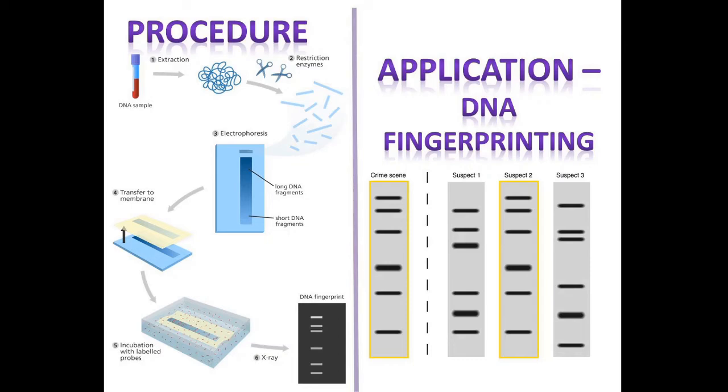To detect a restriction fragment length polymorphism, there are a number of basic steps to which multiple technologies and protocols have been applied. The DNA must first be isolated from the organism or cell of interest, whether that be a prokaryote such as a bacterium or a virus, or a eukaryote such as human cells, with protocols varying depending on the source of the DNA.